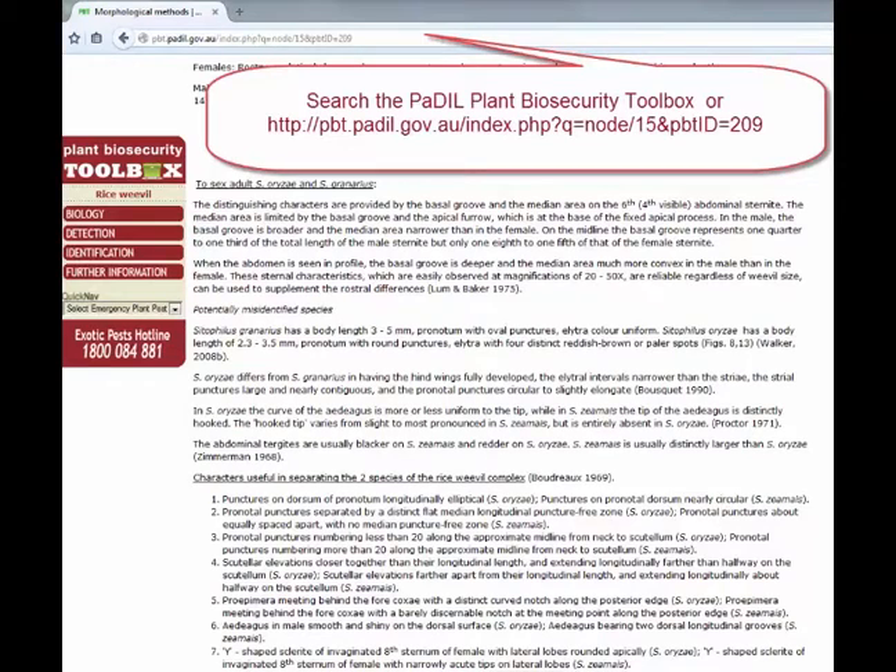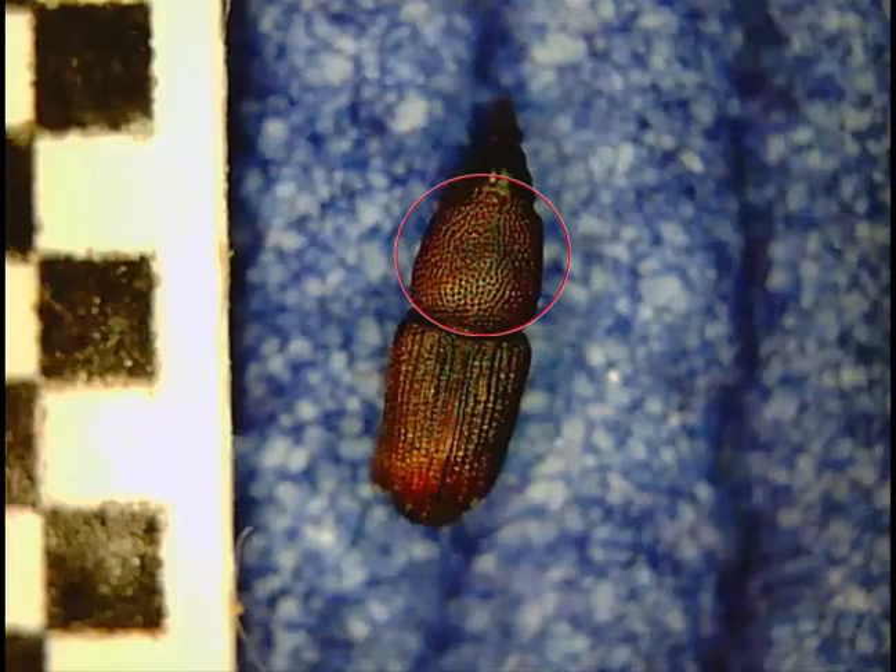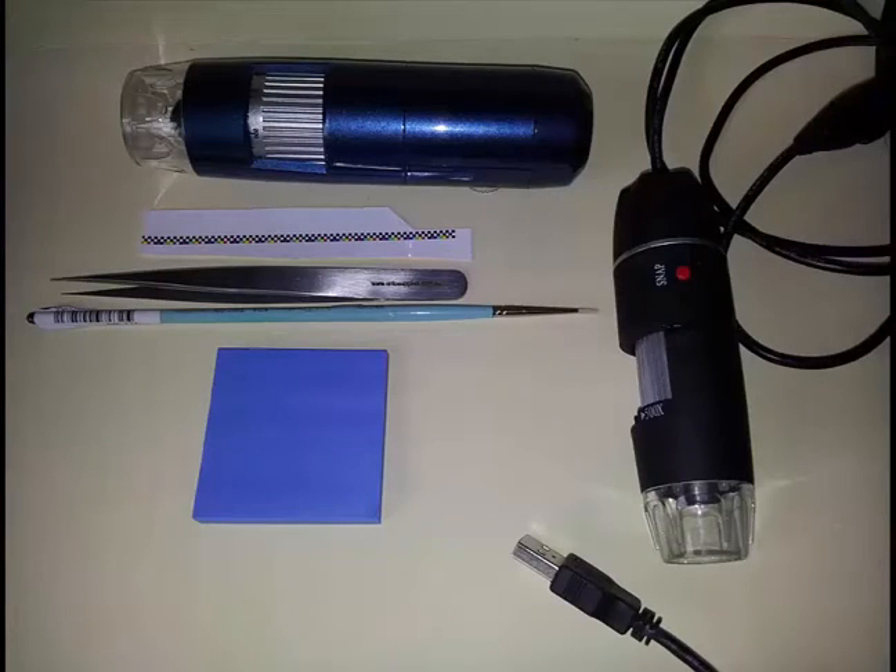I'm going to use some of the tools from the Plant Biosecurity Toolbox on Padil, namely the length of the specimen, the punctures on the pronotum and on the elytra, the structure and the colour. The tools I'm going to use are these USB microscopes and wireless microscope, a scale bar, some tools to manipulate the specimen with, and a blue background to get some better colour differentiation.